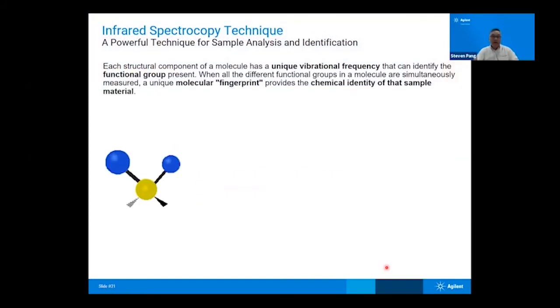Now, infrared spectroscopy is not really a new technique. It has been well over 50 years now, or even longer. But basically, if you look at this slide here, I will not go through all the wordings. I'll just summarize it. It is just looking at how the molecules dance, or the dance of the molecules. Okay, that's why I've got this thing moving in and out when infrared light passes through it. So, dance of the molecules.